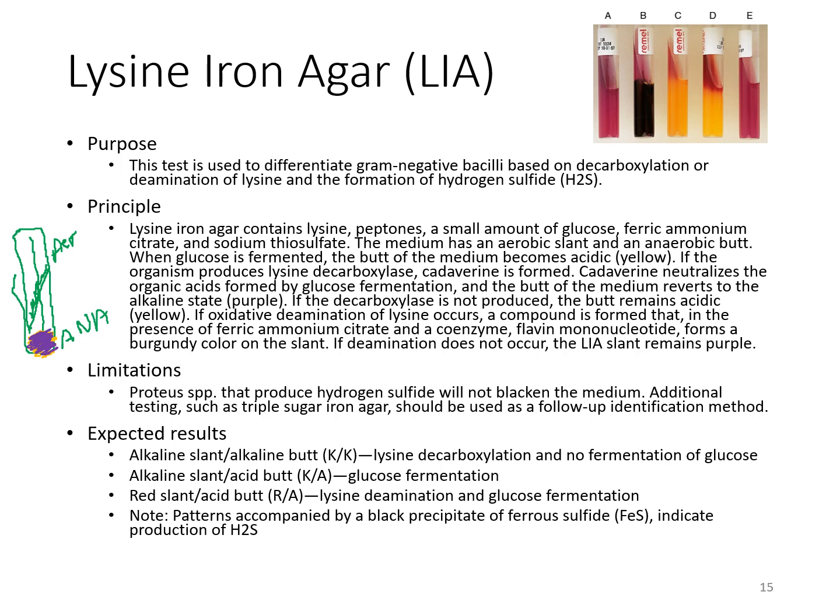And then from there, if the decarboxylase is not produced, it does not produce that cadaverine, which means it will stay that acid yellow color. But if it does, then you'll get that purple color, or it will revert back.